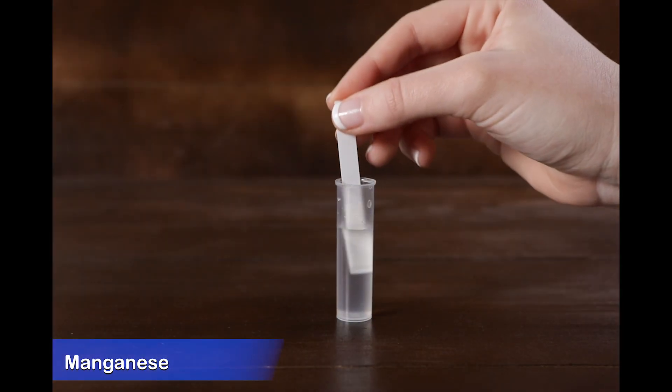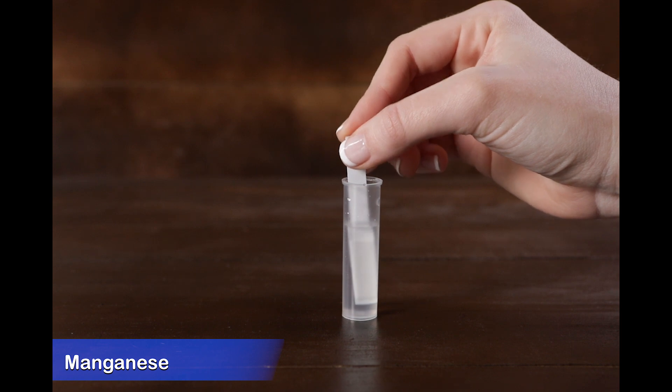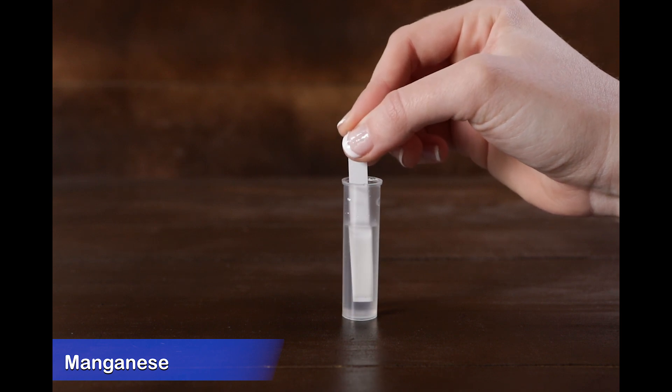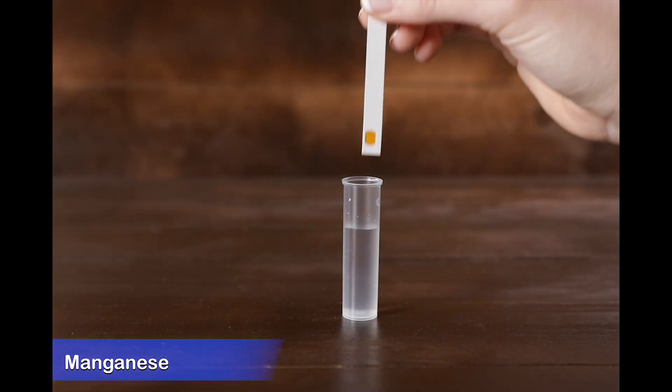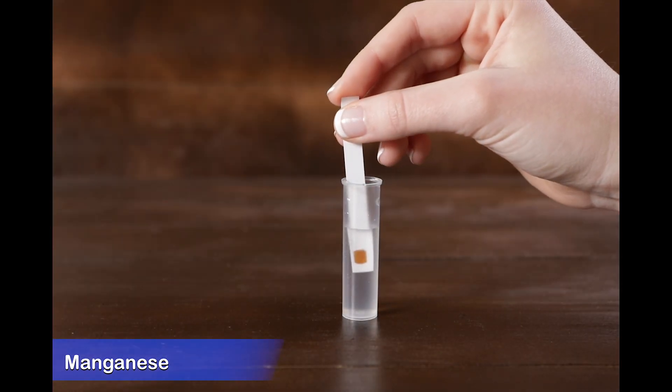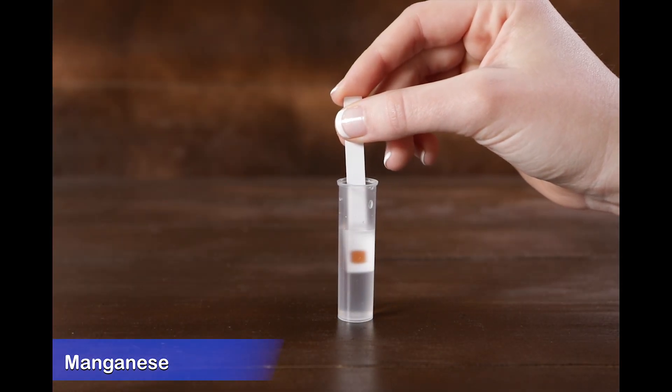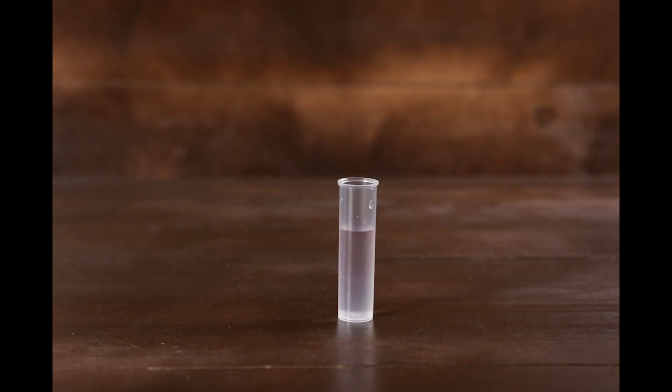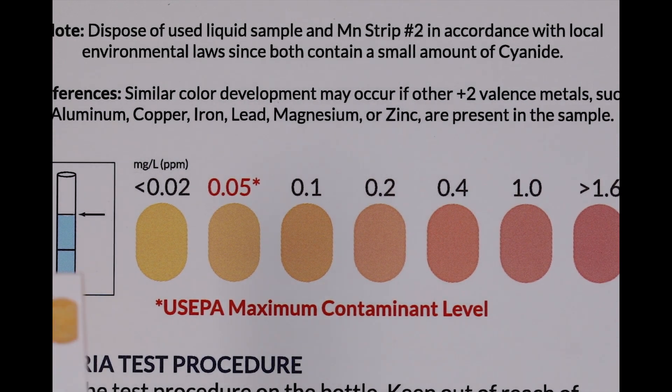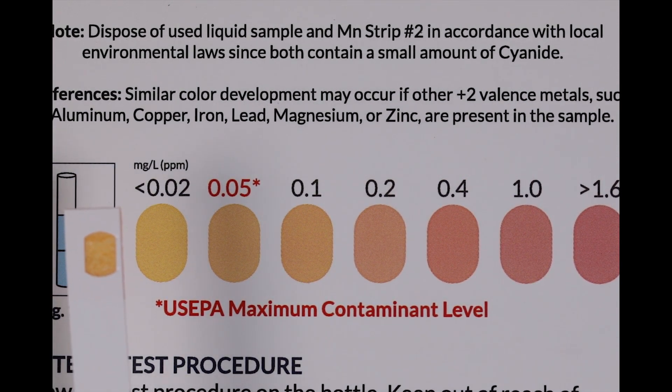Dip manganese strip number two into the vial for 20 seconds using a constant back and forth motion. Discard the strip. Dip manganese strip number three into the vial for 30 seconds using a constant back and forth motion. Remove the strip and shake off excess water. Wait three minutes then match the strip to the color chart.